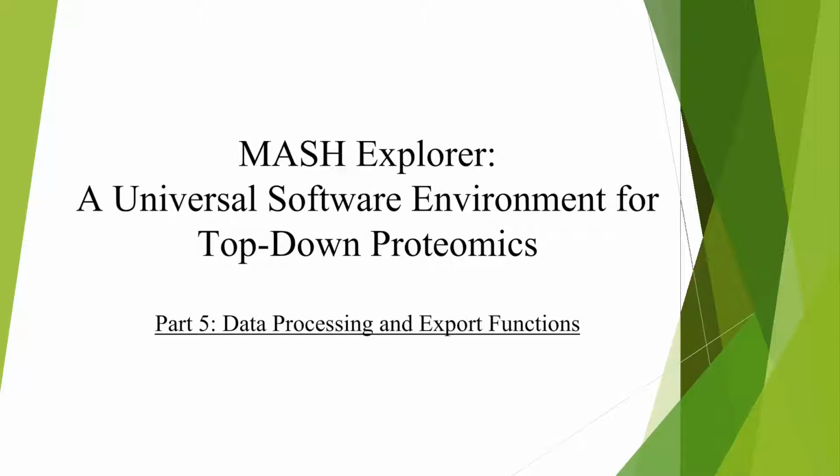In this video, I will be showing you how to use the MASH list and results view, sequence table, ion finder, and data reporting functions in the MASH Explorer software. These tools are essential for the protein characterization function of MASH Explorer.